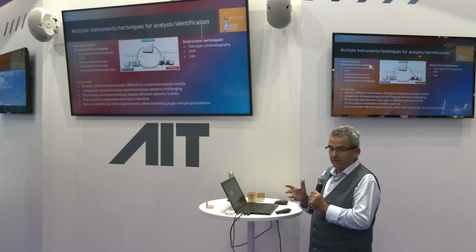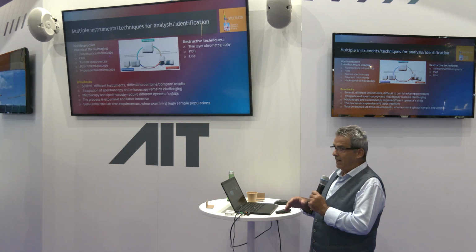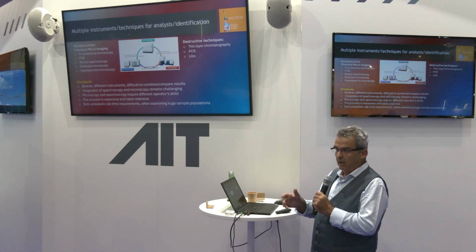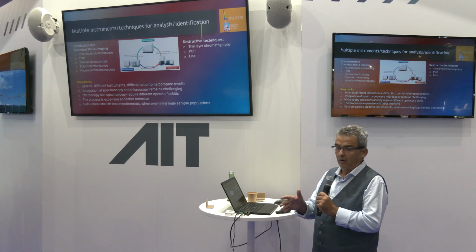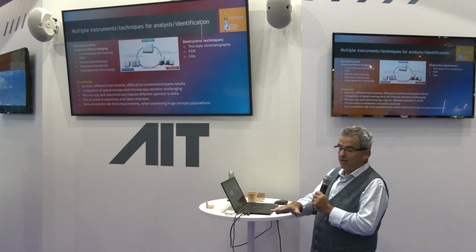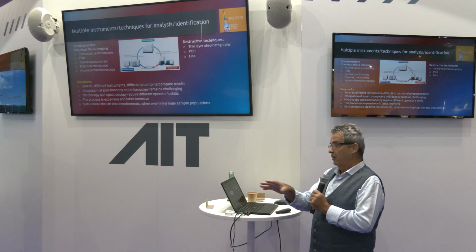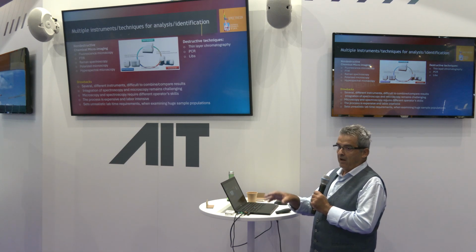I'll start from the field called forensics imaging. They collect traces from crime scenes, and the task is then to analyze which these traces are, whether it is semen or blood or DNA material or a variety of different kinds that can be found, either human or natural materials. So the idea is, is it possible to scan a full region of a crime scene, put it on the microscope and do an analysis that runs in a completely unsupervised manner, and after 3 or 4 hours give you results about the chemical identity of the traces and be able to classify whether there are some existing materials.